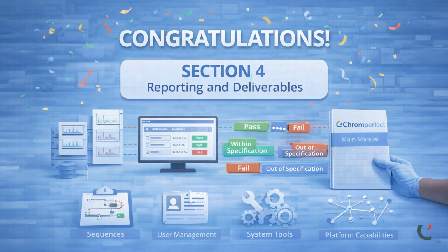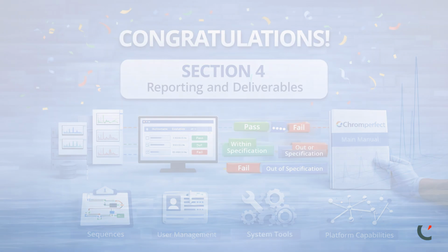Congratulations! You have now completed Section 4, Reporting and Deliverables. You should now have a clear understanding of how reports are created, applied, and delivered within Chromperfect, as well as how they can be extended to support advanced workflows such as multi-channel reporting, automated evaluation, and conditional result interpretation. In the next and final section, we will move beyond reporting and begin to explore how Chromperfect operates at a system level, including automation through sequences, user management, system tools, and extended capabilities across the platform.